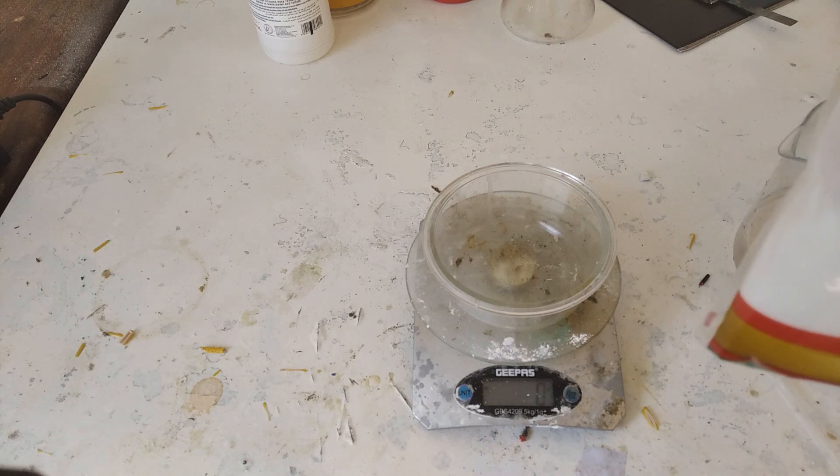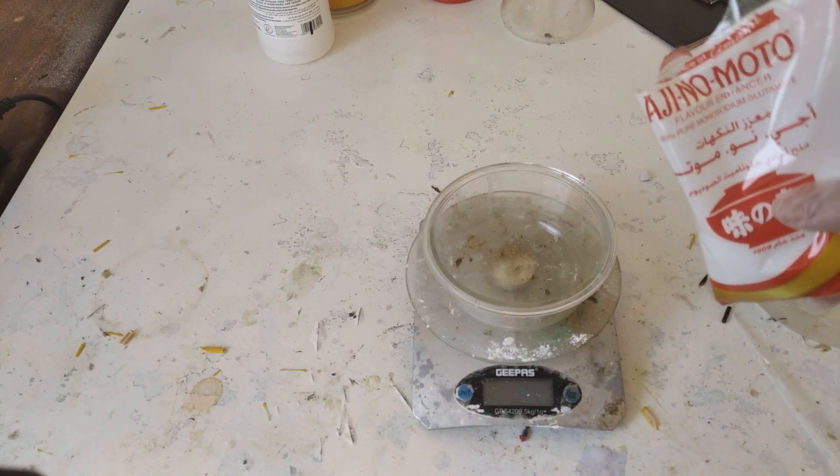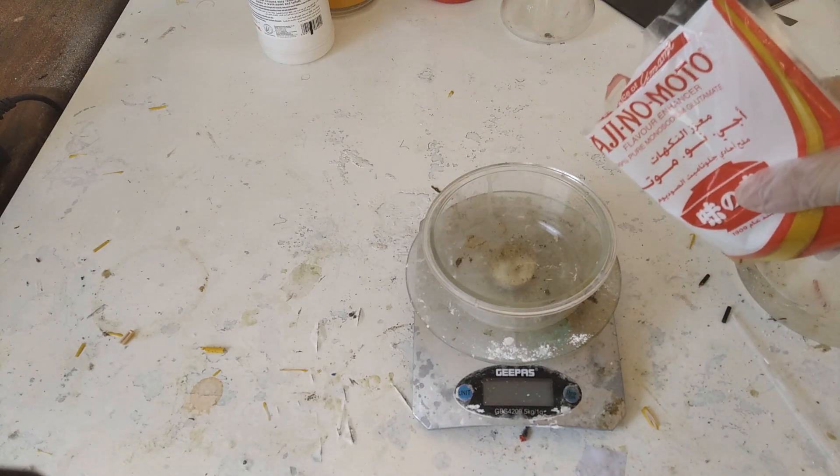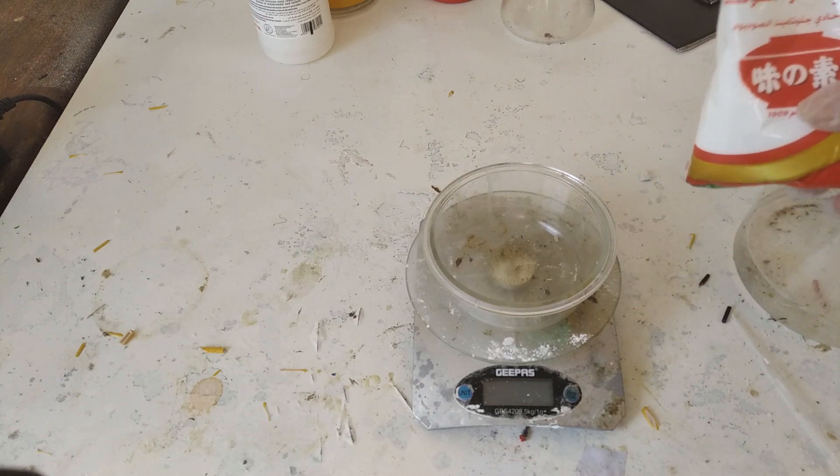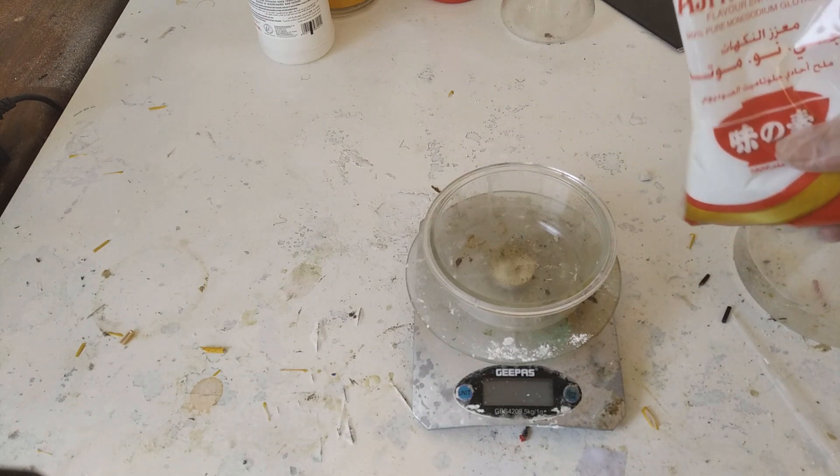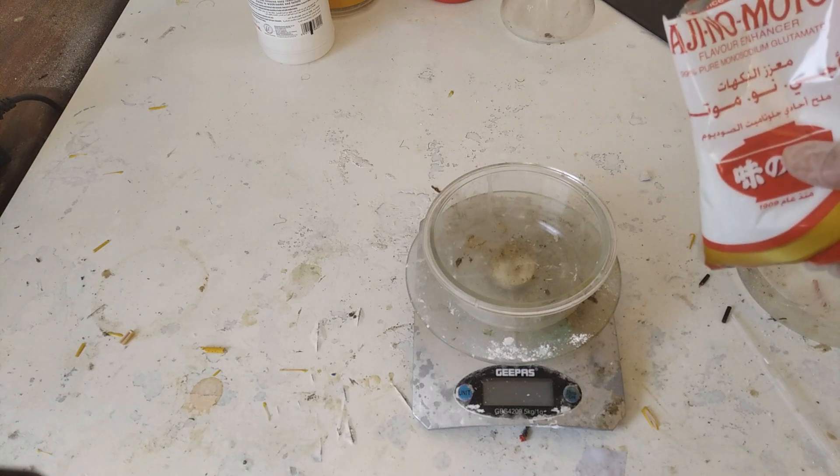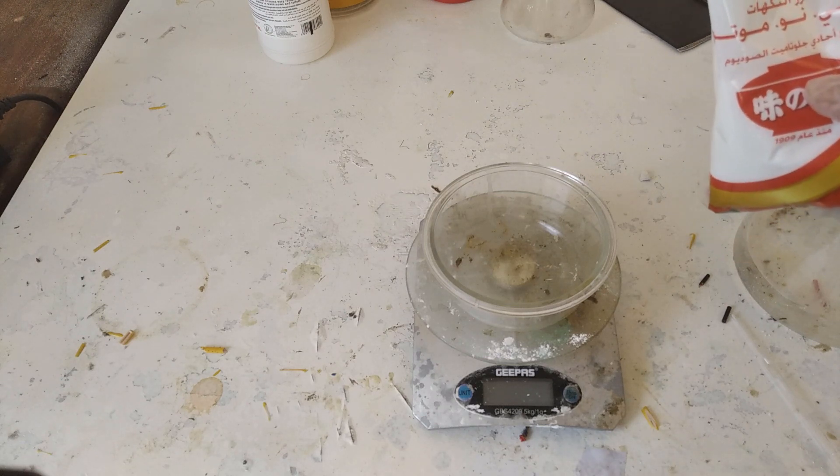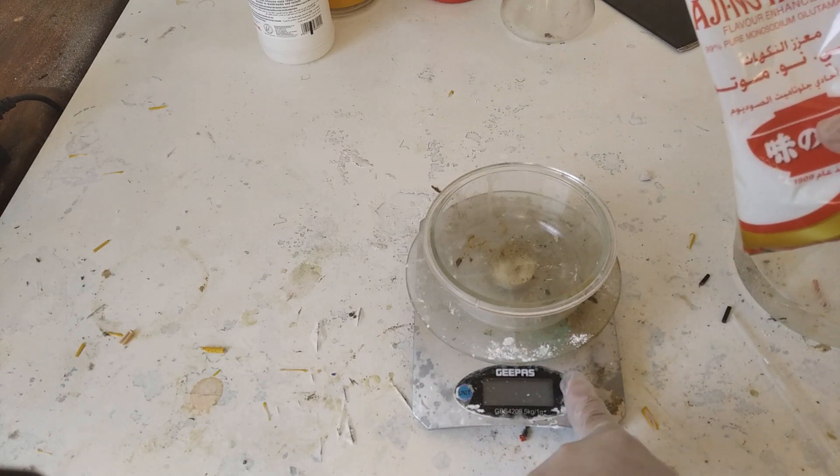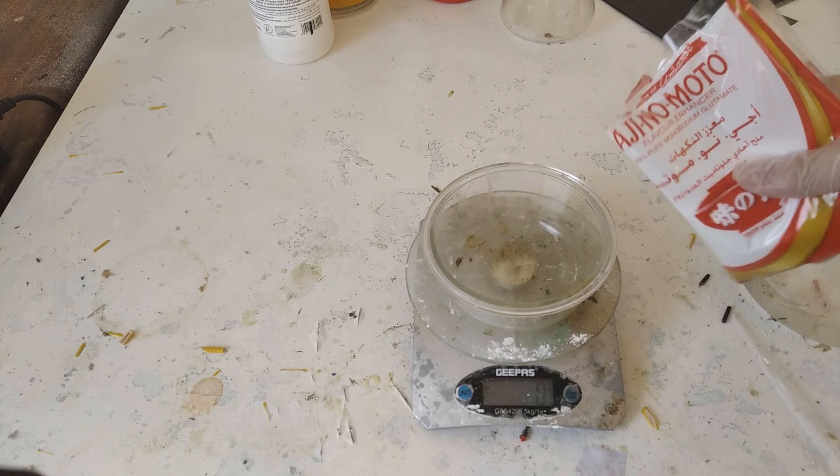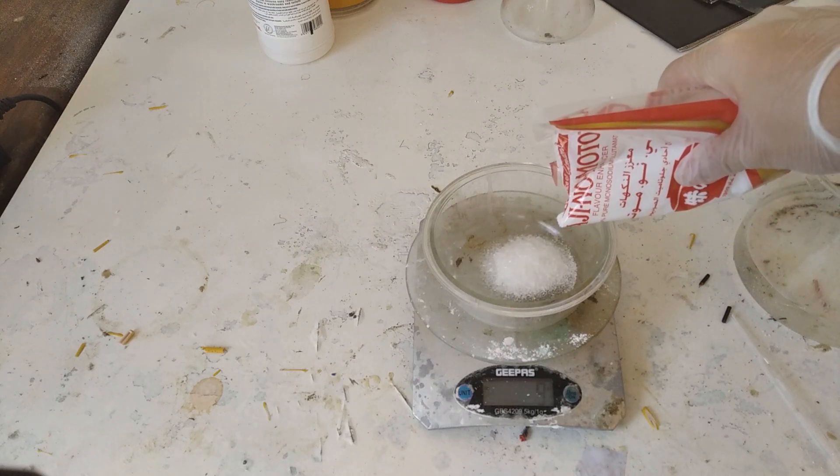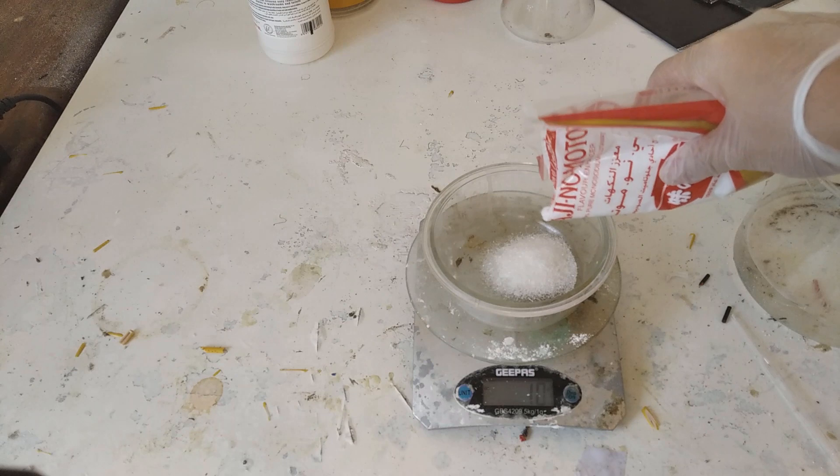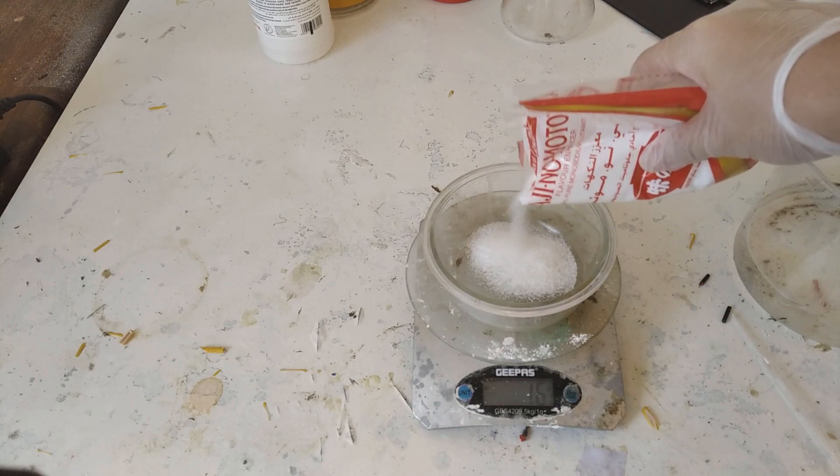So we have here our sodium glutamate and I found out from calculation earlier by looking at the molar mass ratio that you basically need a 1 to 1 ratio. Well it's more like 1 to 1.12 but 1 to 1 is a slight excess of citric acid if you want to save on glutamic. Depends on which one's cheaper. Well in my case this is actually cheaper.